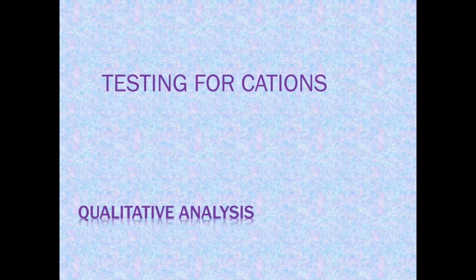So qualitative analysis is mostly about testing for two things. You either test for the cations that are present within a substance which you don't know, and most of the times you'll just be given a substance which you call maybe substance X or substance Y. You don't know the name of that substance, which cation or which anion it has. So for you to know that substance, we test for the cations and also test for its anions to give you the exact name.